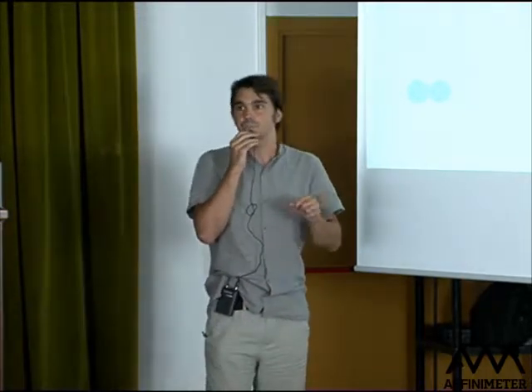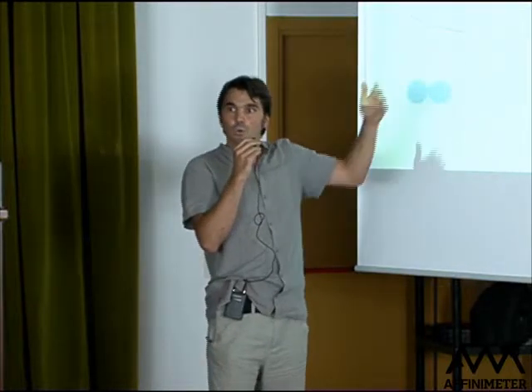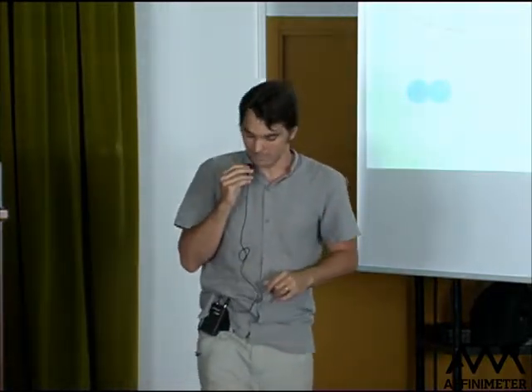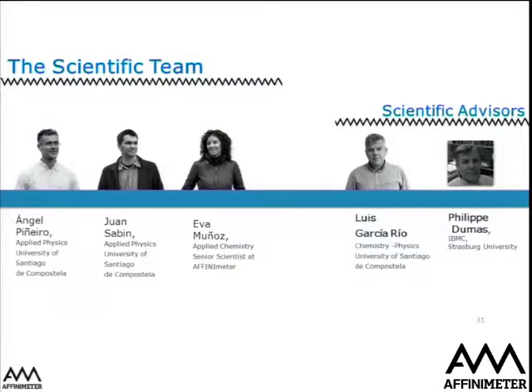Binding induced by dimerization. So some ligands need to be dimers before they bind. So you can write all these models very easily in AFFINImeter. So this is the scientific part that I think Angel also showed before. And I just want to finish with the first sentence that I was telling you before.